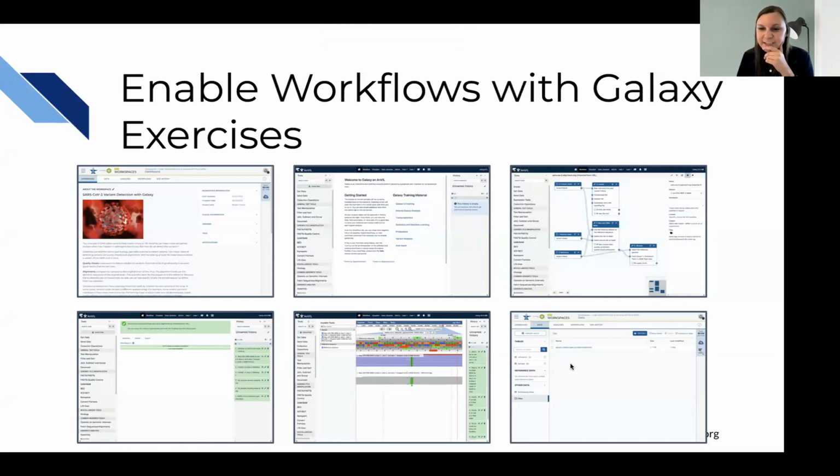So of course, this is a pretty simple example, pretty fun. This is hopefully showcasing how you can scale the resources that you need. You can also run Galaxy exactly as you might with a few new interesting ways that you can interact with it in terms of being an administrator of your instance where you can install your own tools. There are some kind of unique ways that you can use Galaxy and AnVIL as well. And then use that in the AnVIL protected environment that's suitable for using human genomics data.